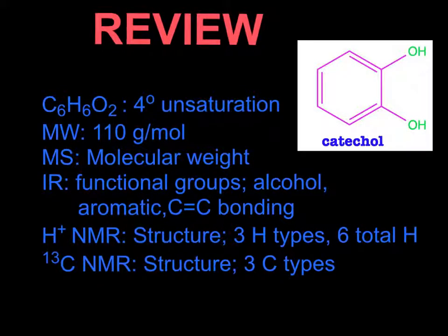In review, we can be given a molecular formula and a molecular weight. Then, with information based on MS, IR, HNMR, and carbon-13 NMR spectra, we can construct an adequate molecular structure. In this example, our hypothesized structure proves true and is an alcohol known as catechol.